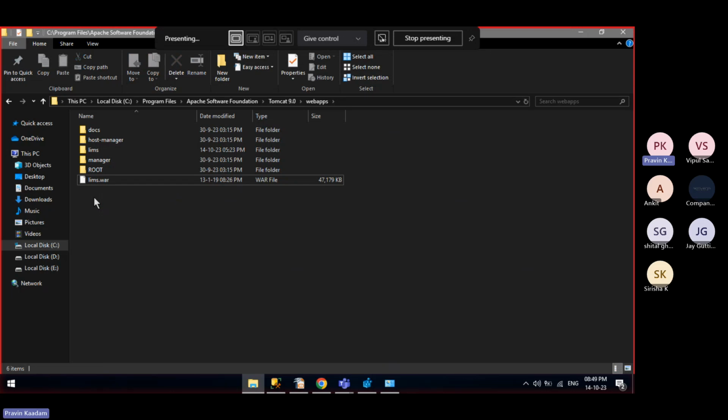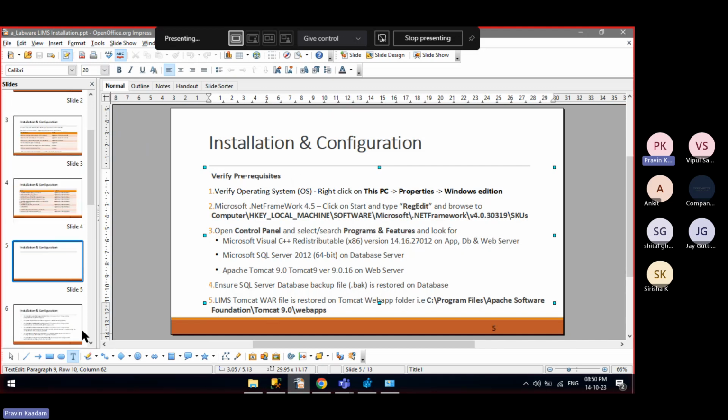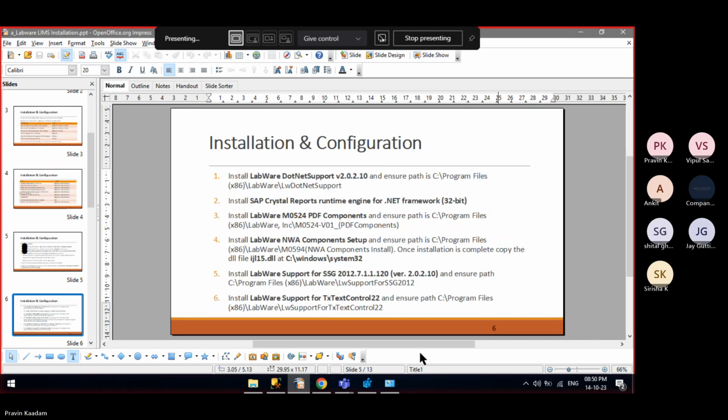Okay, it is also your installation step. You have to stop the Tomcat services, but we will see that in the installation steps. So at this stage, we just need to verify the file is available. Yes, the file is available. So all the prerequisites at this stage are verified. Next, we will start with the installation process.